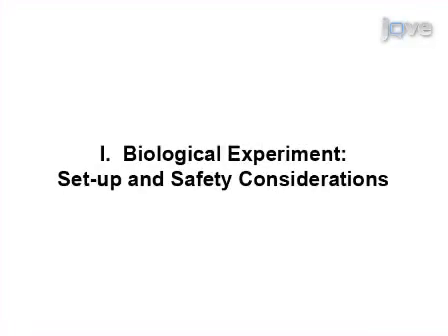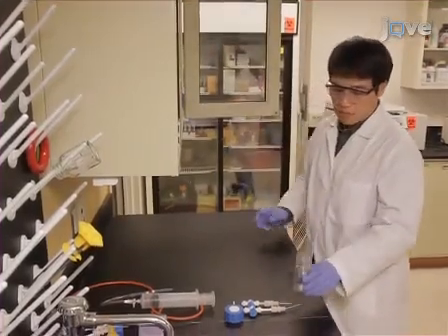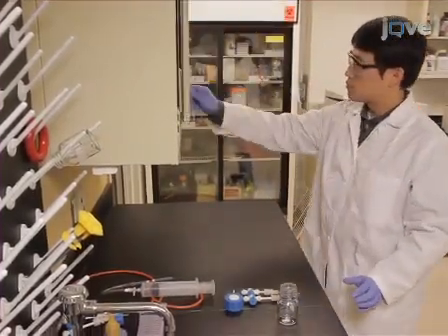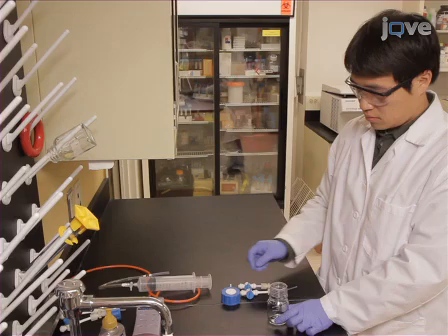Choose the appropriate vessel for growing your culture, considering the growth requirements of the species as well as the efficient delivery of volatiles to the mass spectrometer. In this demonstration, we have selected standard 100 milliliter Pyrex media bottles.